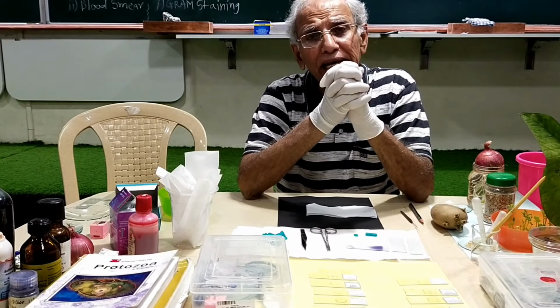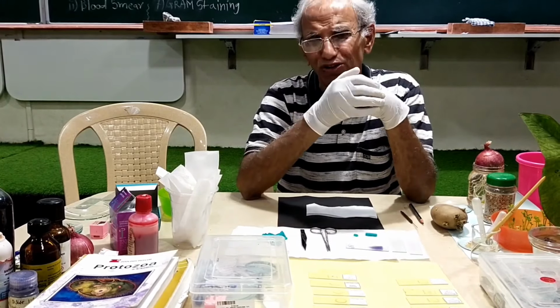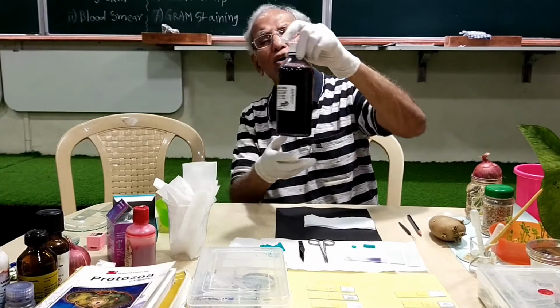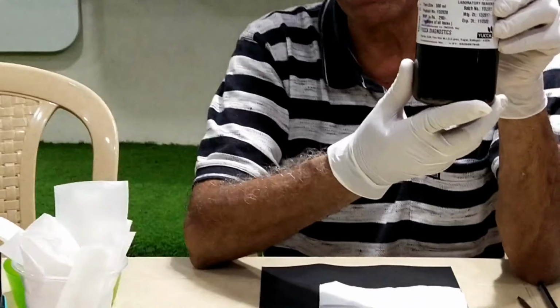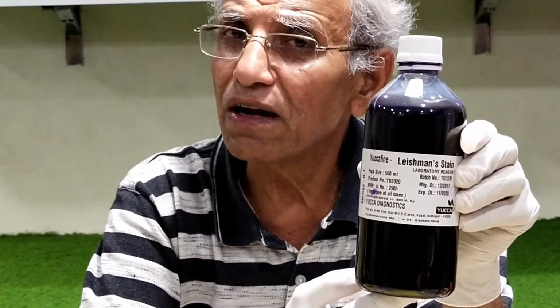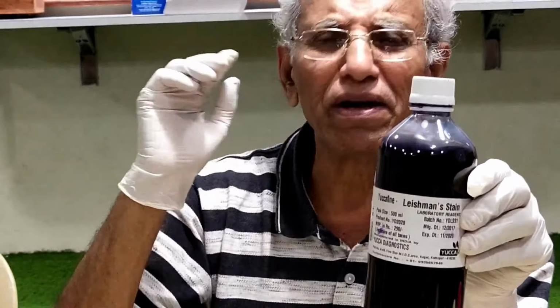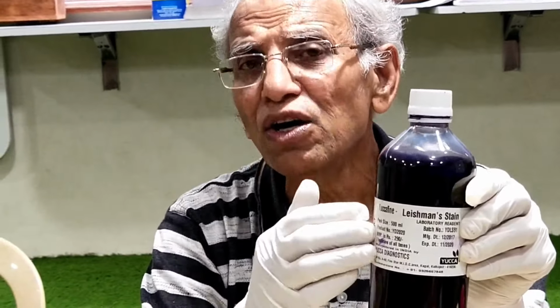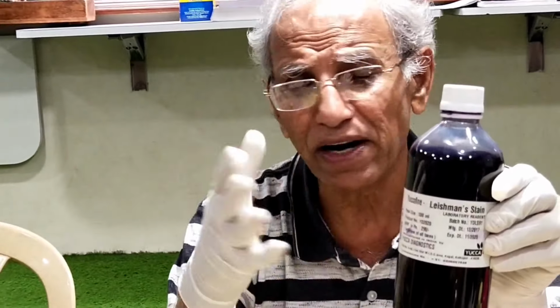That's one thing. Secondly, you don't need any staining also. Staining is required. Okay, I'll say about the staining. Here is what is called Leishman stain. Can you read this? Leishman stain. This Leishman stain is meant for observation of the WBCs. Today, I think we are not going to do it because we have many other items in the sequence. But Leishman staining will definitely be shown to you once we go for the chapter of circulation sometime later on, the blood and other things.